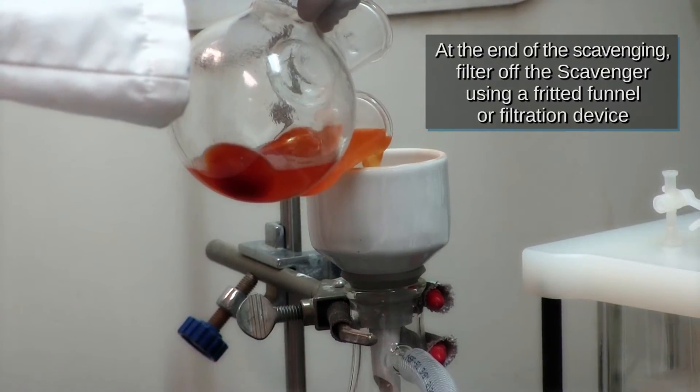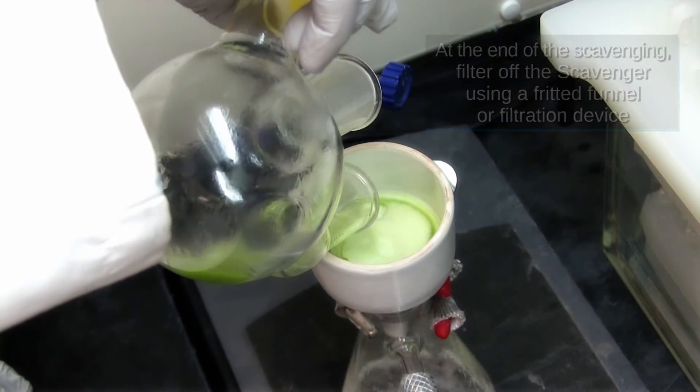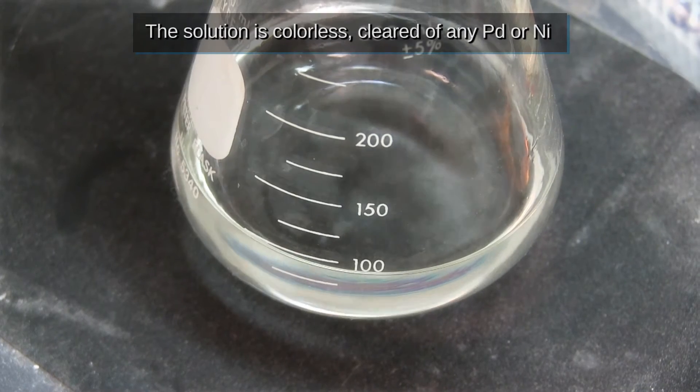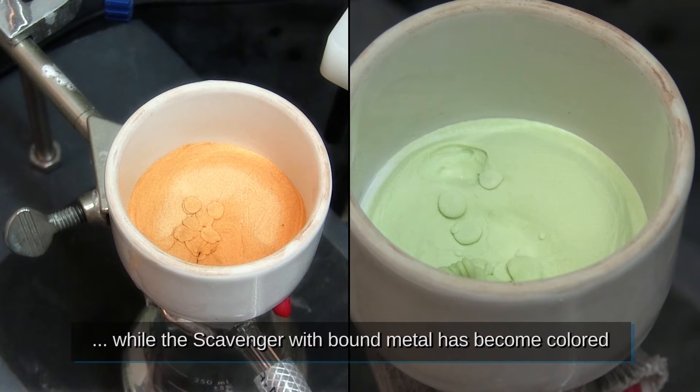At the end of the scavenging, filter off your scavenger using a fritted funnel or any kind of filtration device. The solution is colorless, cleared of any palladium or nickel, while the scavenger with bound metal has itself become colored.